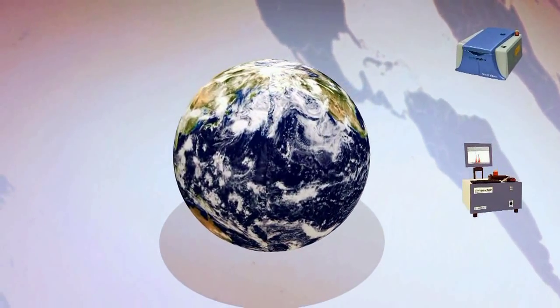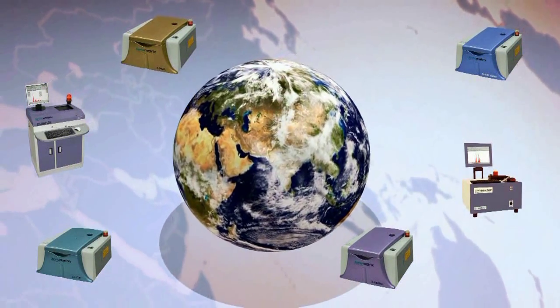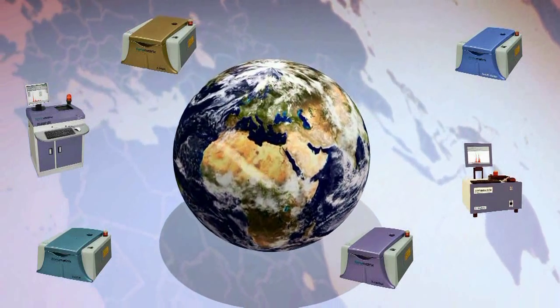Unlimited number of S-Mobile analyzers and other Xenometrics brand equipment can operate simultaneously and forward all data to the main server.